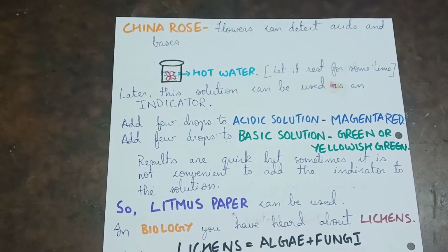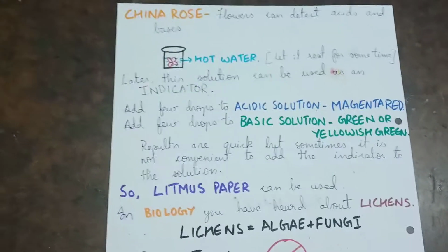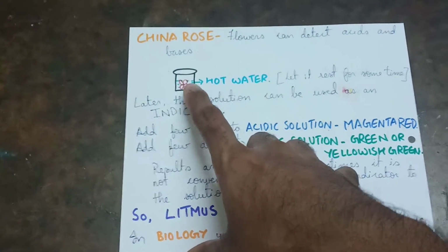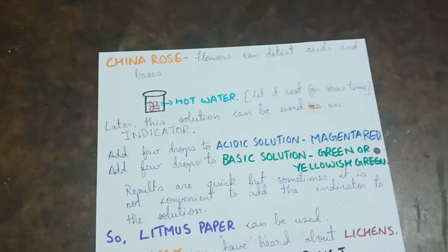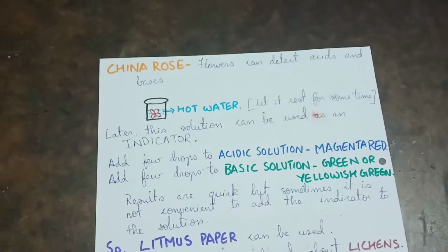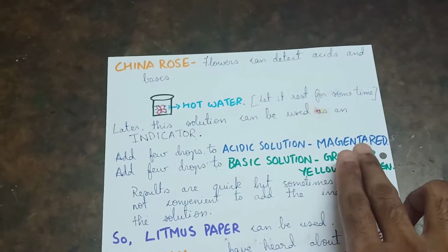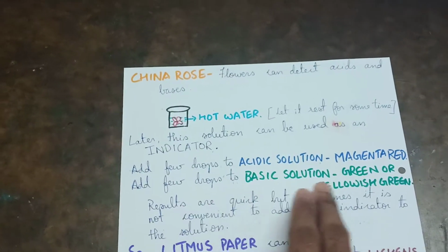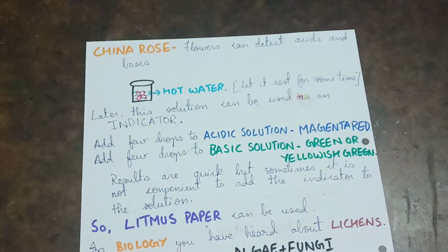If you add a few drops of this solution to an acidic solution, you get magenta red. Magenta red is maroon red, a very dark red. And if you add a few drops to a basic solution, you get green or yellowish green.